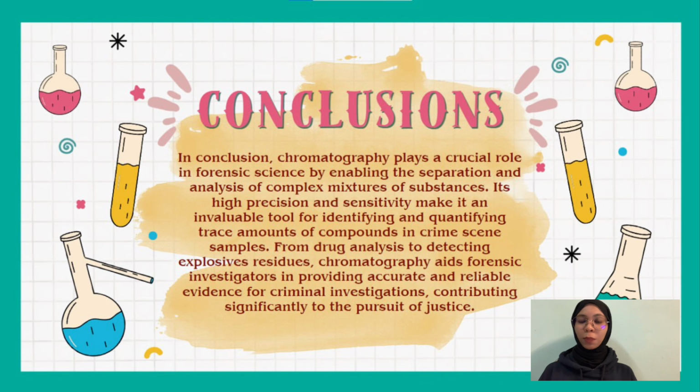In conclusion, chromatography plays a crucial role in forensic science by enabling the separation and analysis of complex mixtures of substances. Its high precision and sensitivity make it an invaluable tool for identifying and quantifying trace amounts of compounds in crime scene samples. From drug analysis to detecting explosive residues, chromatography aids forensic investigators in providing accurate and reliable evidence for criminal investigation and also contributing significantly to the pursuit of justice.